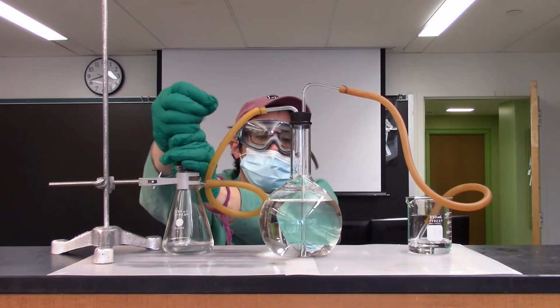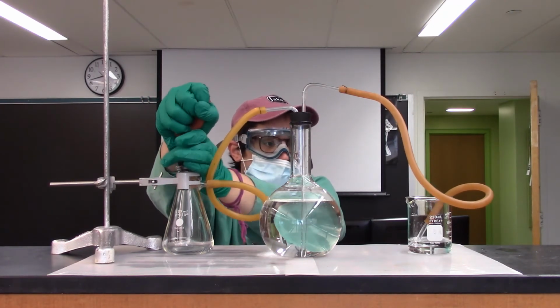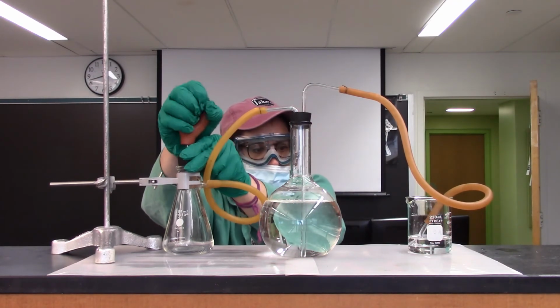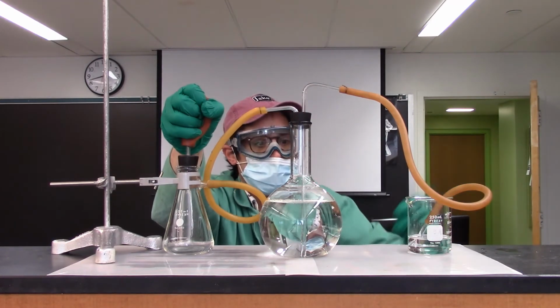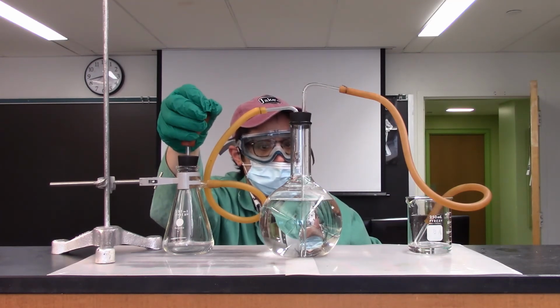So this is really important to do, and it's important to purge this a whole bunch of times. And you can see here, I get a nice system going because every time I squeeze it, I'm seeing all that move and fluctuate. So that's really good. We like to see that.